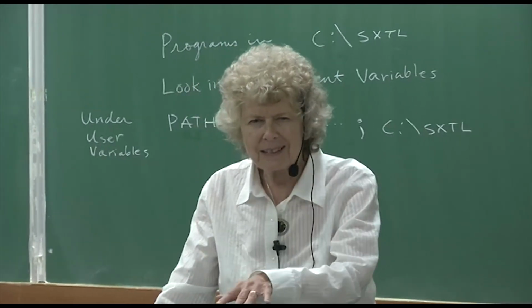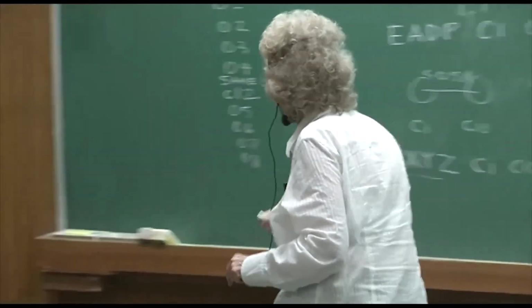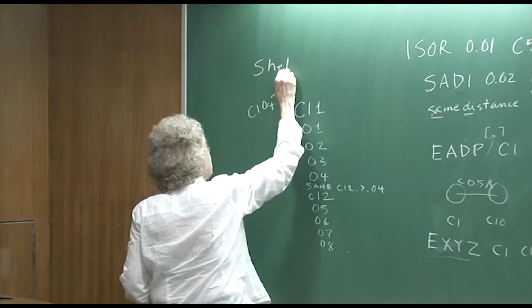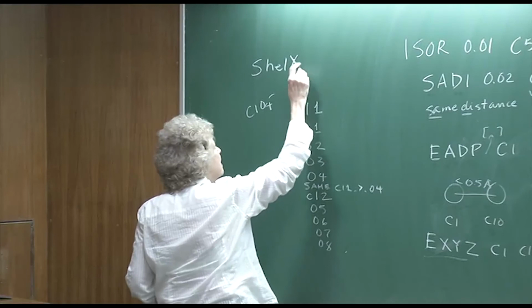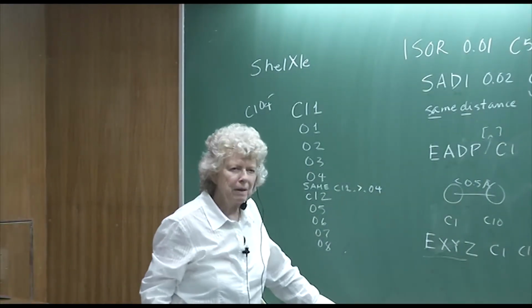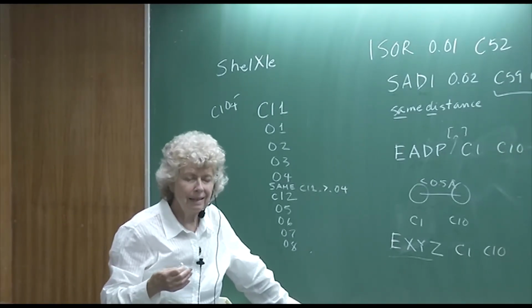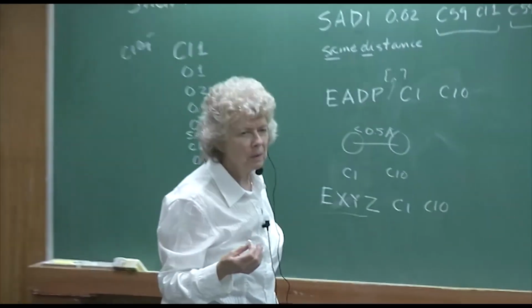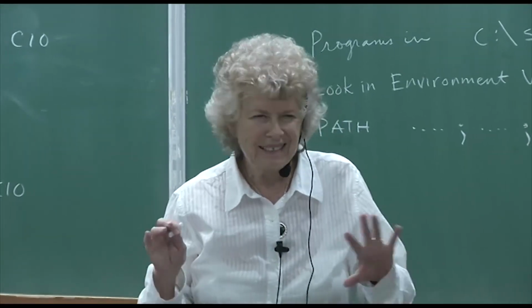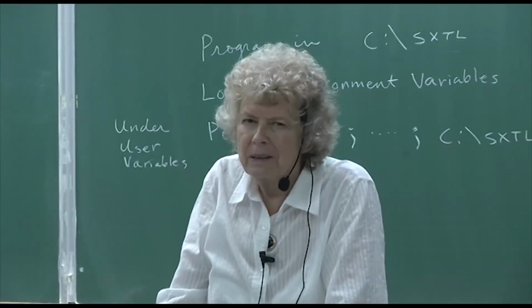Has anybody ever looked at that program that I mentioned? I think it's spelled with a capital X and then an LE after it. I've only looked at it a little bit, but I've been impressed with its ability to model fragments, update the weight for you, and check that your unit statement is correct. It's very helpful, very, very helpful. It's more up to date really than WinGX.